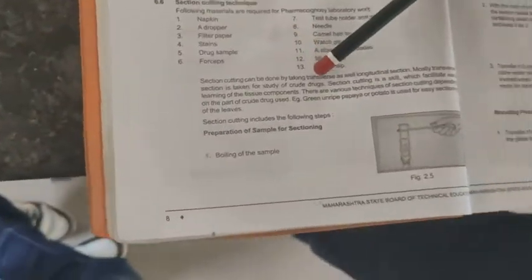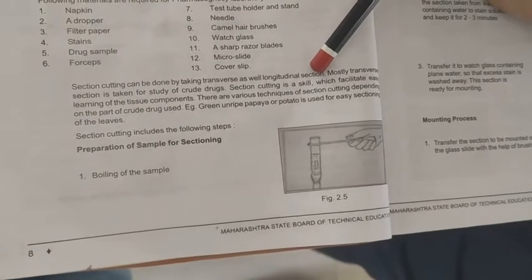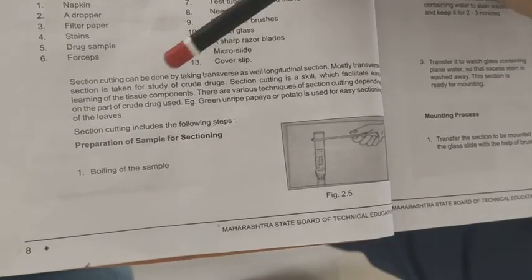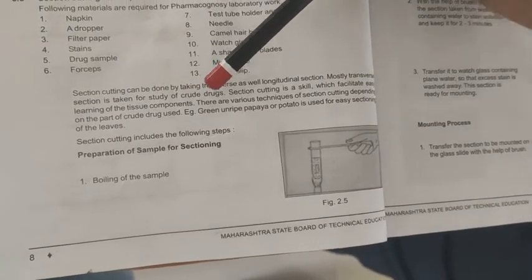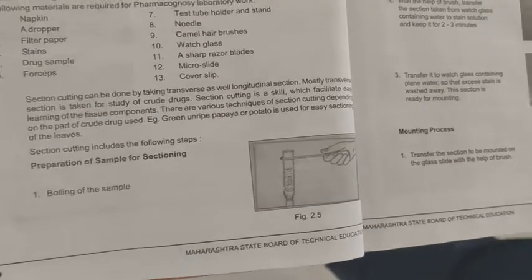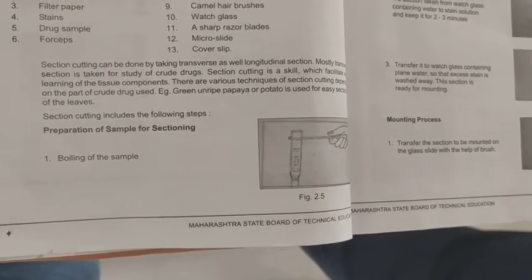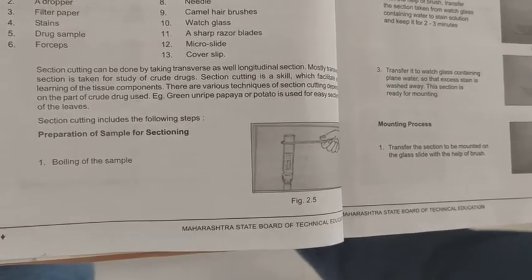Section cutting can be done by taking a transverse section as well as a longitudinal section. Mostly the transverse section is taken for the study of crude drugs. As I have told you, there are two types of method, that is TS and LS. TS means transverse section, LS means longitudinal section.